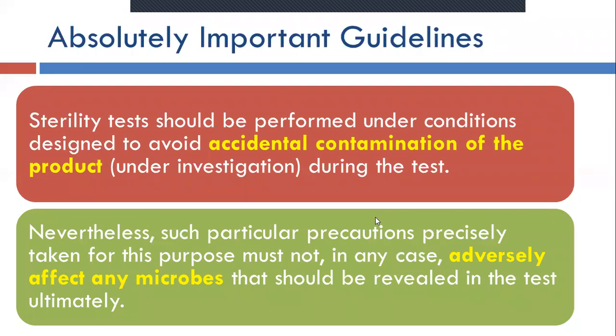The very first care we have to take is that there should not be any cross contamination during the investigation or during the testing of the product. Second thing: you have taken the maximum care, sterilization and other things, aseptic conditions, everything. But in any way, these precautions we are taking should not adversely affect the growth of the organisms, if any are present in the product.